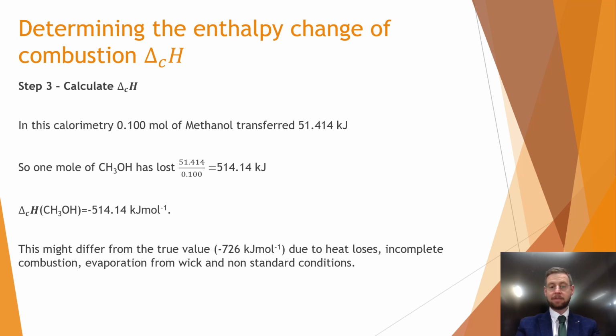And it may be different because maybe we haven't measured all of the heat, maybe there was incomplete combustion, evaporation from the wick, or maybe it was non-standard conditions. Also, we might actually be experiencing cooling, where the water might be losing heat to the environment at some rate whilst it is still being heated up. It would be important to draw a cooling curve and extrapolate it to work out what the total energy difference would have been. For more on that, it's worth watching the video of PAG 3.1. That shows exactly how to do this.